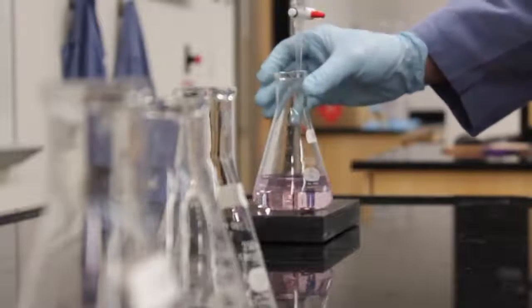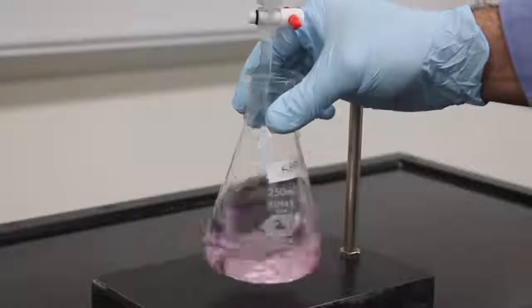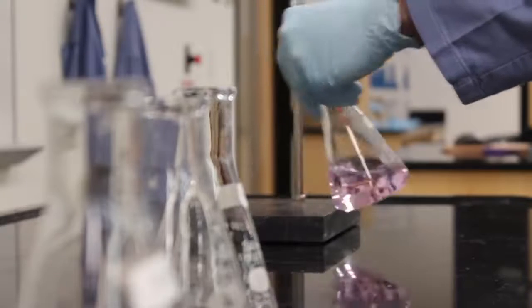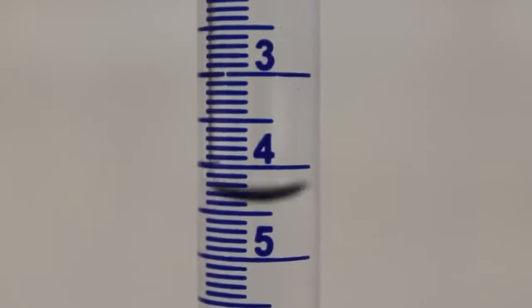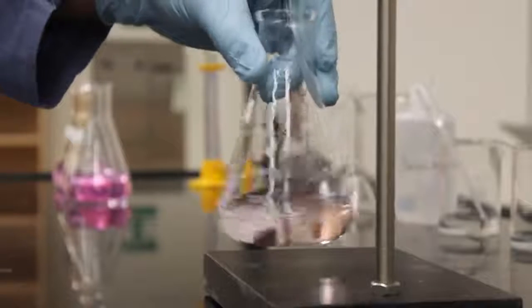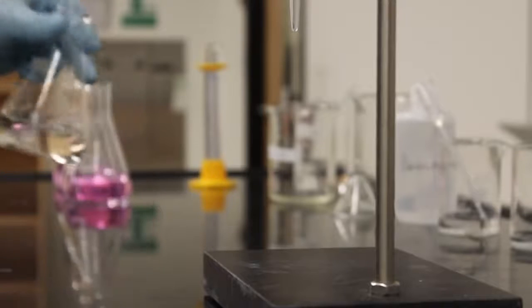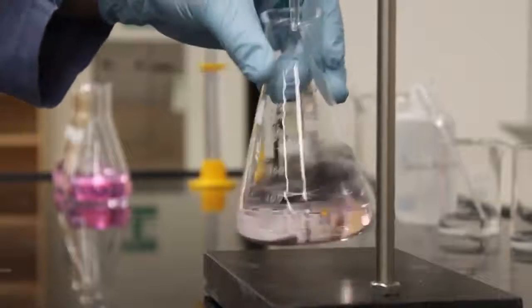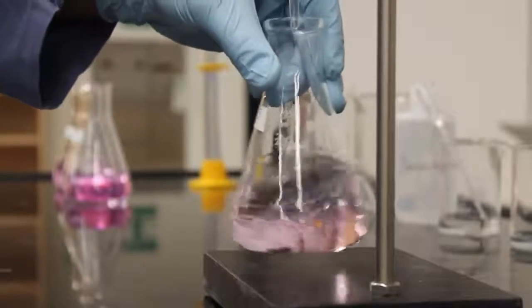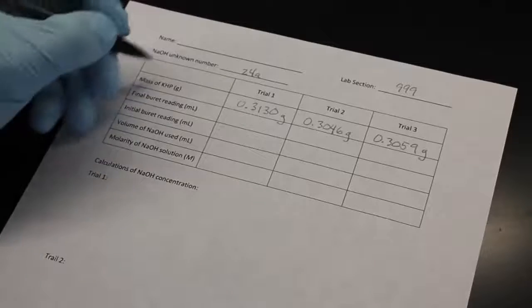You will need to titrate the rest of your solutions as well. I will speed up the process so it doesn't take so long. Remember, to get good results, this process does take some time. Don't forget to document your initial and final burette readings.